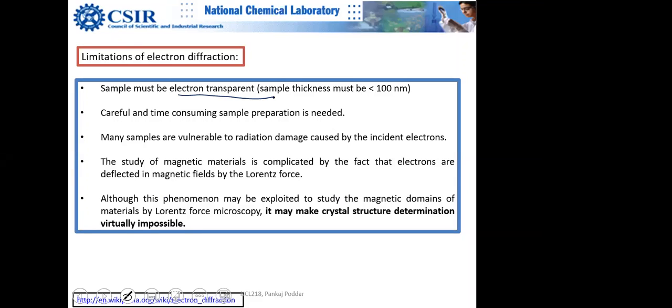This is also a limitation for HRTEM, that you should take a thin sample. But this is not a problem for SEM. SEM is a very powerful technique for biological samples, polymers, thick polymers. So thick samples, okay, you can put an entire hamburger inside the SEM.